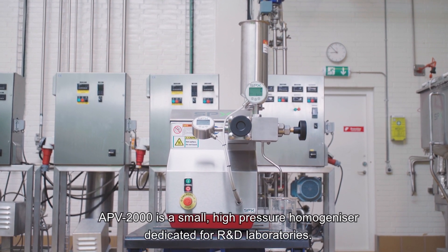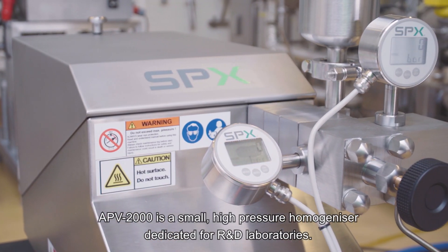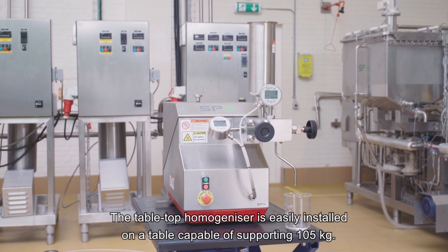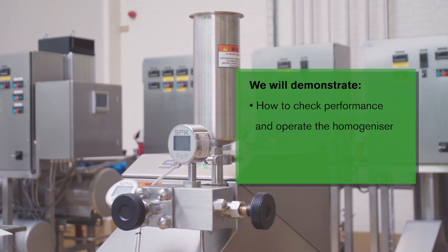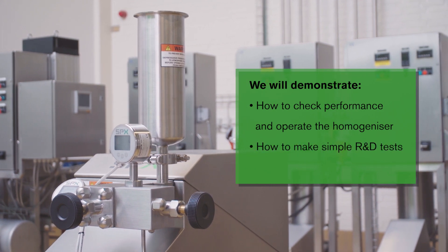APV2000 is a small high-pressure homogenizer dedicated for R&D laboratories. The tabletop homogenizer is easily installed on a table capable of supporting 105 kilograms. We will demonstrate how to check performance and operate the homogenizer, how to make simple R&D tests, and how to ensure proper cleaning.